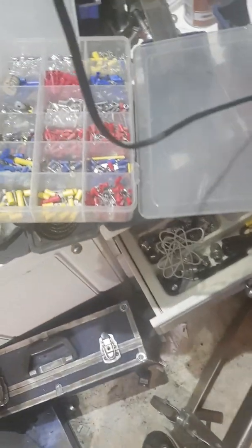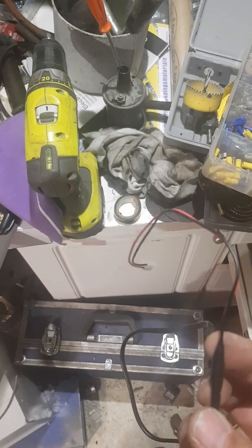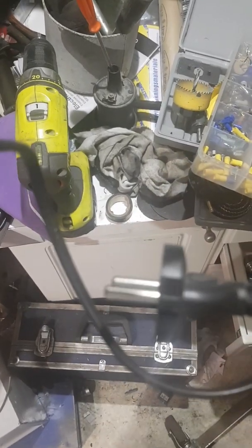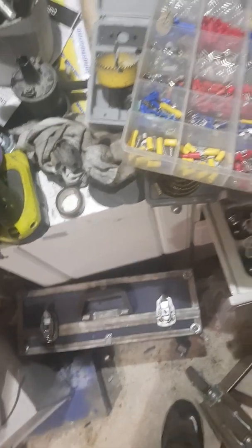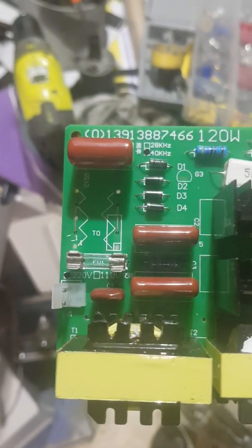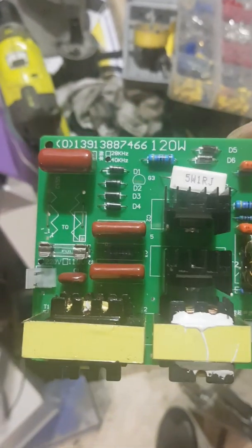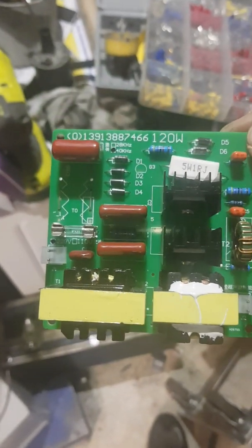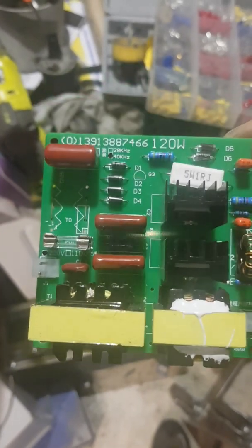Half an hour later, and I'm done with the wiring for the transducers. I've also made a wire for the power cord — that's this one right here, 220 volt. I'm looking at the PCB and it says 220 volts, so I'm glad this thing has a fuse, because I have no idea what happens when I turn it on. But we'll find out soon enough.